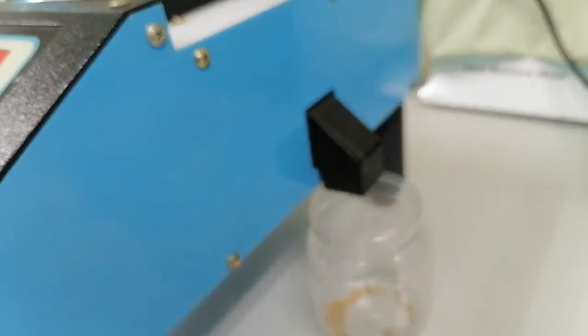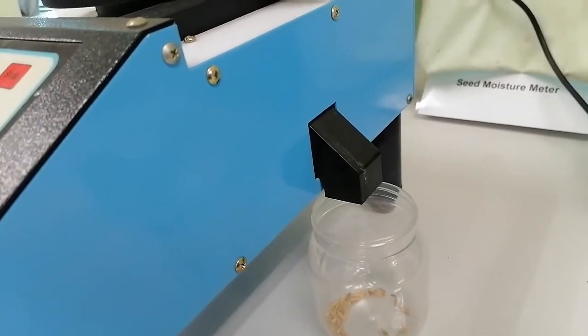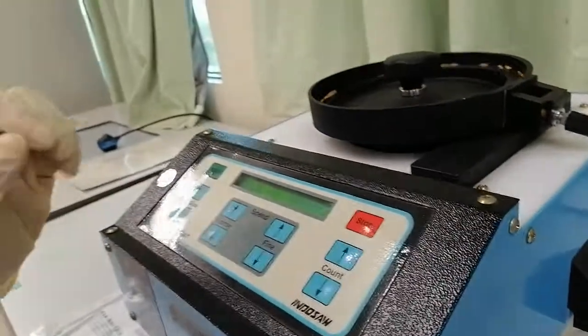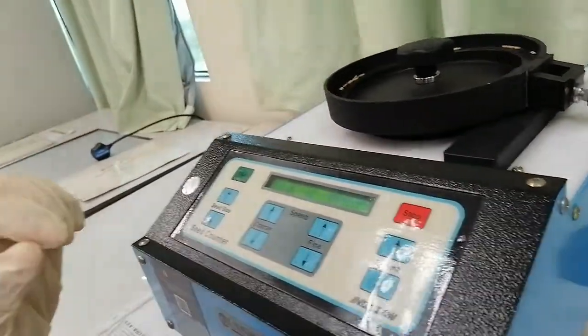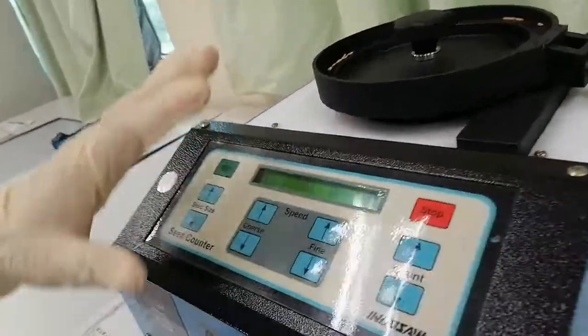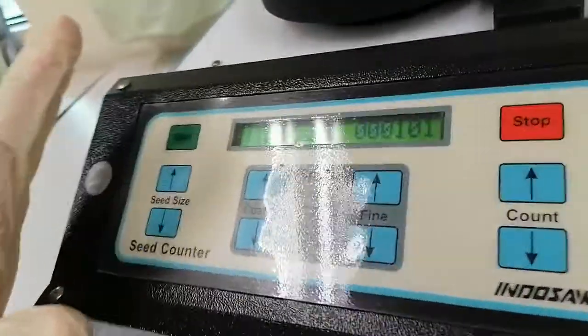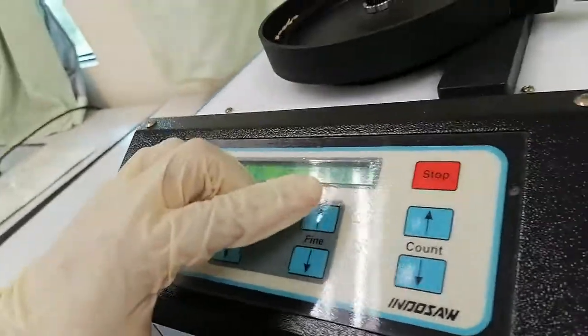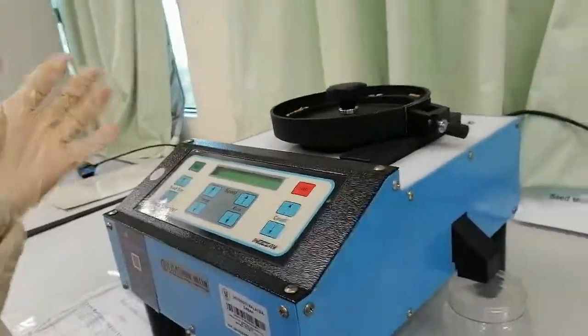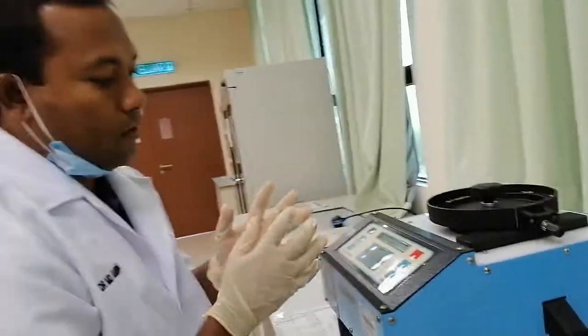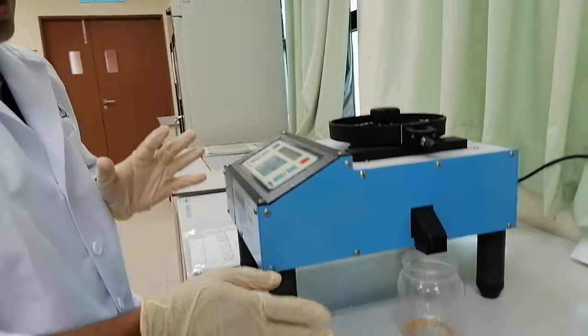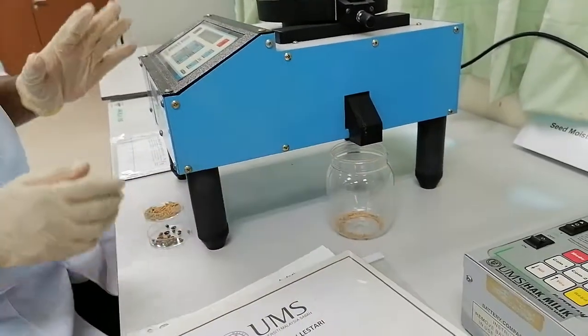By this way we can count the seed, but here better we should reduce the speed if the seed is smaller. When the number is reached 100, then automatically the machine will off. So you can see 101, so in 101 the machine is automatically off. Very easy to control it. No need to worry about 100 seed. When 100 seed is already reached to the reservoir pot, the machine will off.